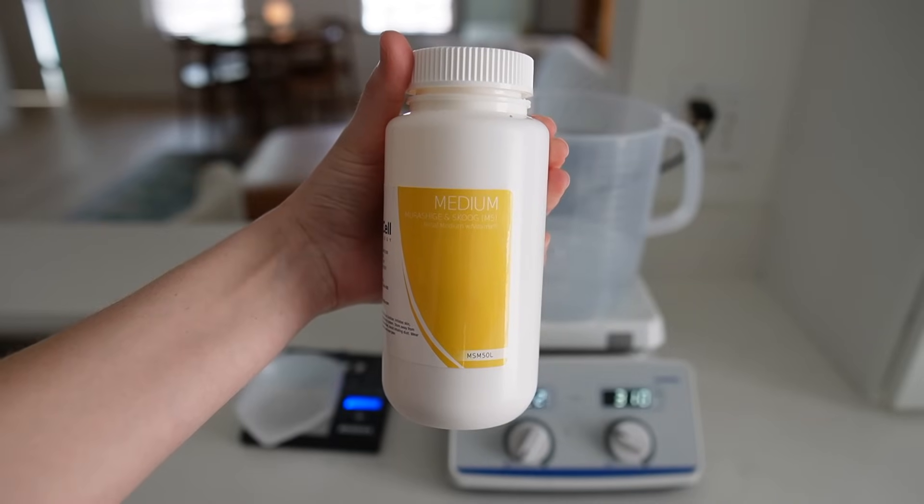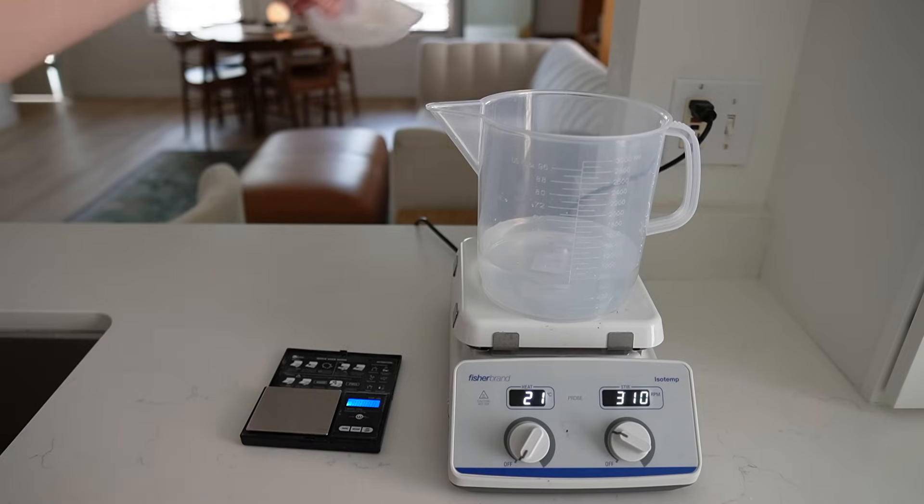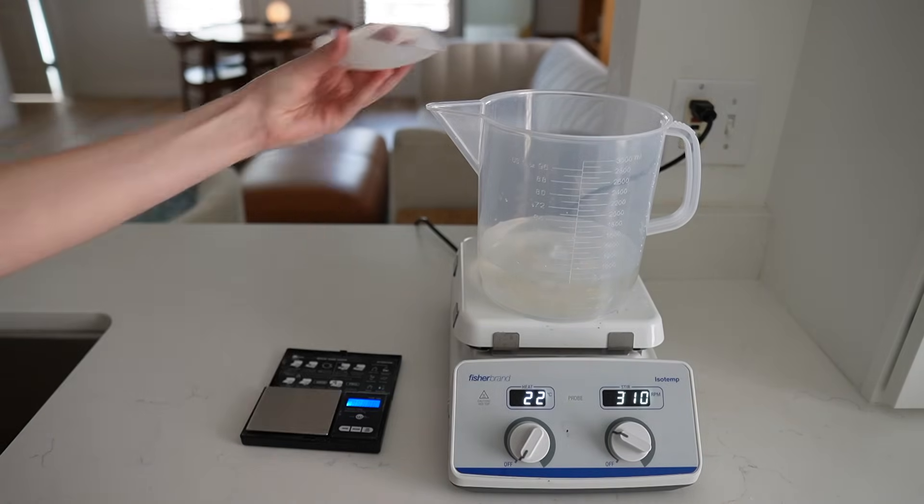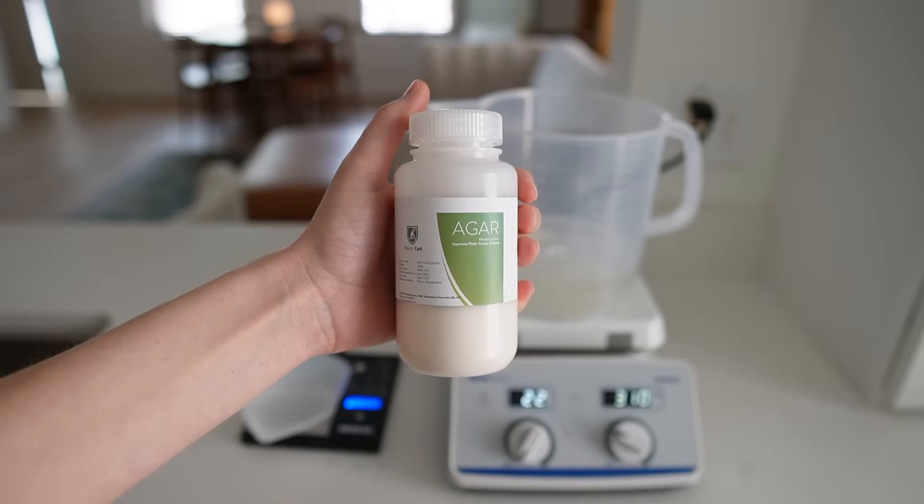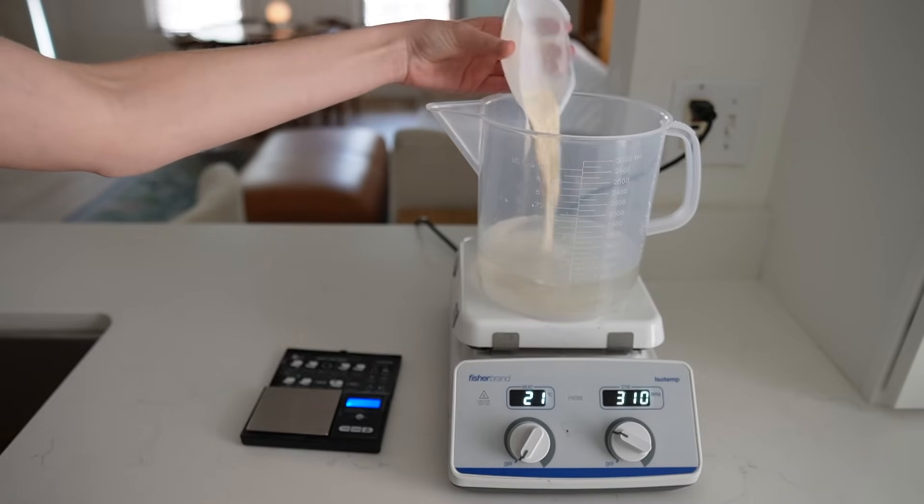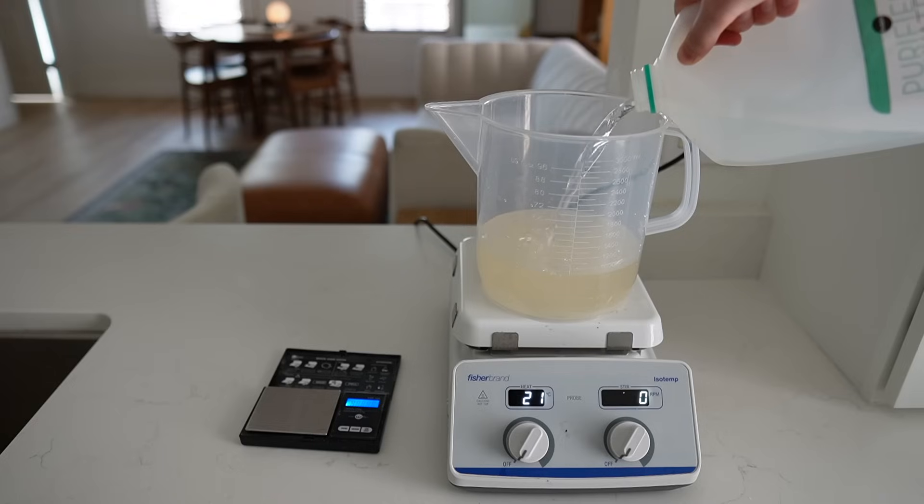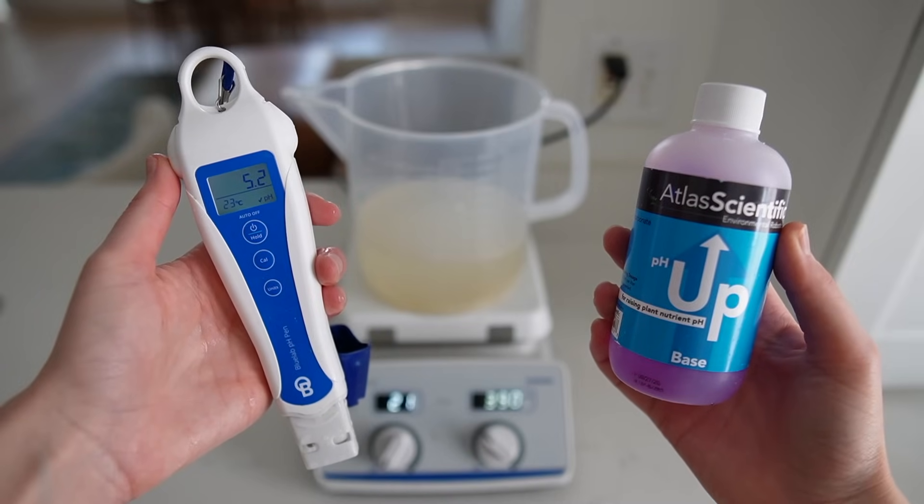To my water, I add 4.54 grams of Murashige and Skoog basal medium. I add 30 grams of sugar, and I also add 7 grams of agar. Once all of the ingredients are added, I top up the container to the one liter mark.